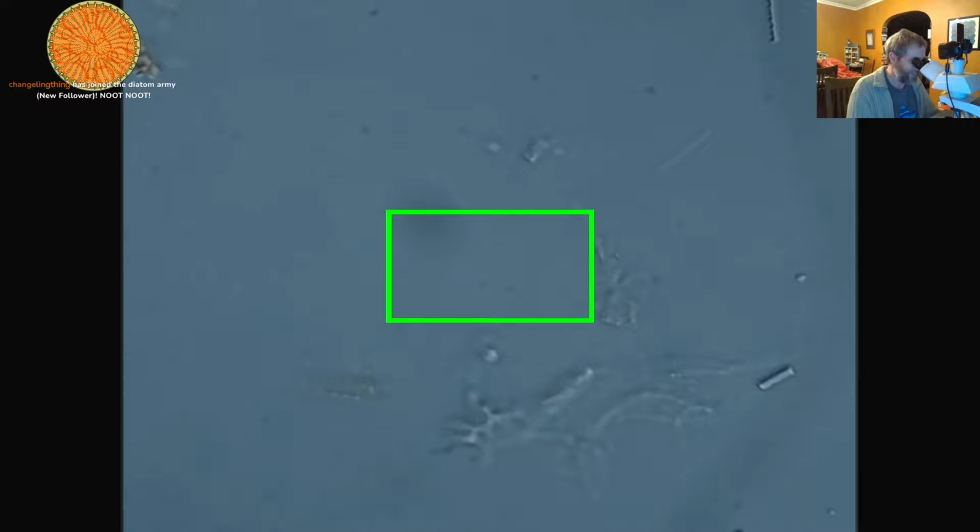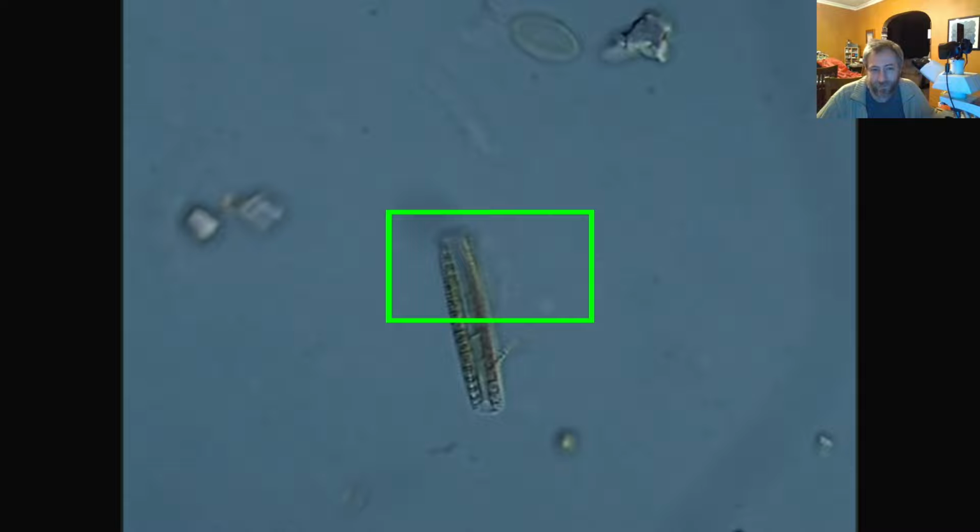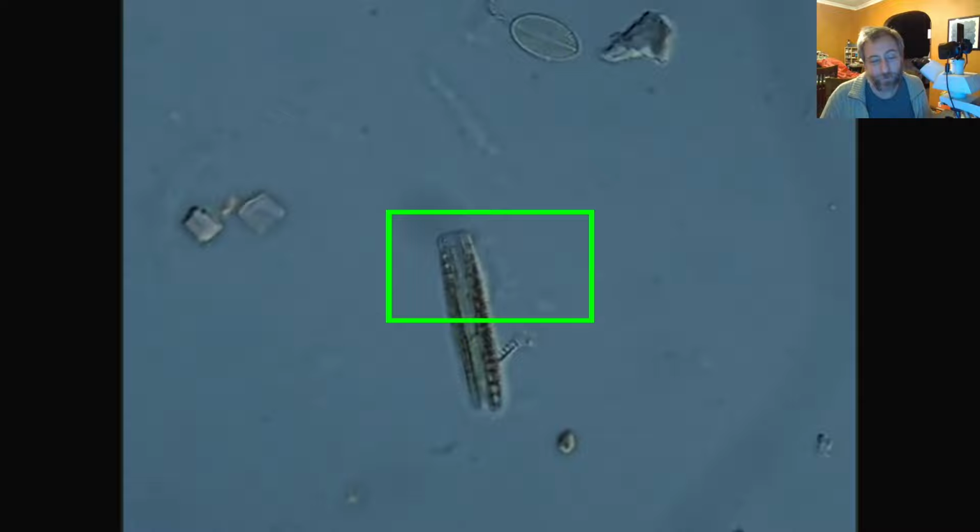She sent me the sample and said, hey, there's a big diatom in here. I don't know what it is, and could you take a look at it? And I said, sure. And then I went looking for it on my stream on Saturday, and I thought I didn't find it because I couldn't find something that I thought matched it. And then I got home, and I looked closely at the SEMs, and I was like, I actually think this is the right one. And in the process of looking at it very closely, I realized there was actually two species in there, not just one. And then I showed both of them to somebody who's an expert with these things, and they were like, hey, I think there's two new species in here. And so we'll likely describe two new species.